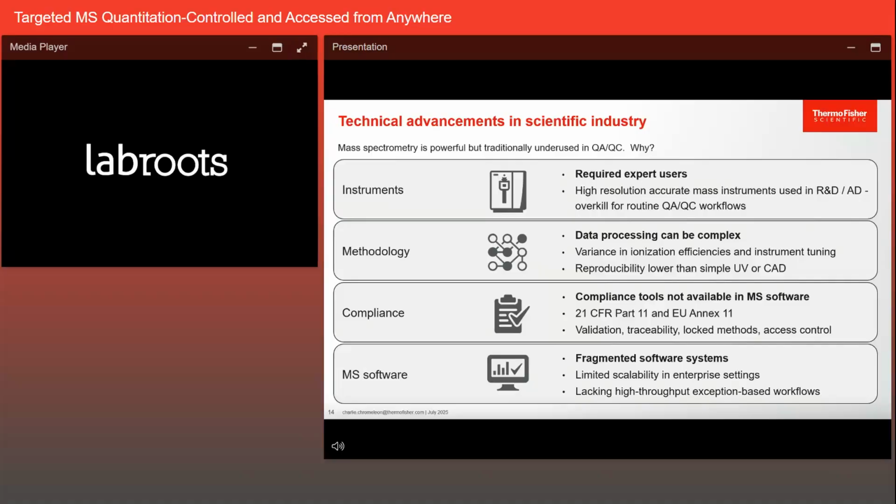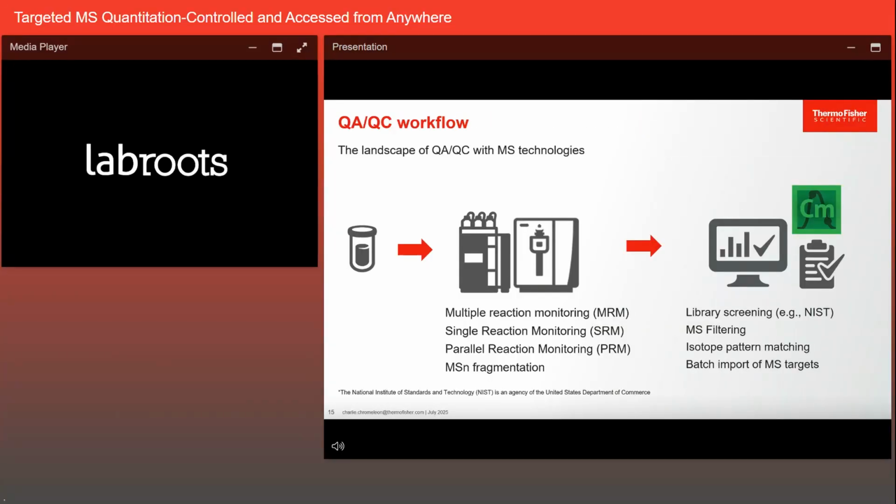When you couple this with the fact that each mass spectrometer seemingly had its own software platform, this made familiarization incredibly difficult, but also scalability and training of your analysts. The increase in different experimental approaches to quantitation and confirmation also meant that different tools needed to be used in order to properly handle the data being acquired in these experiments.